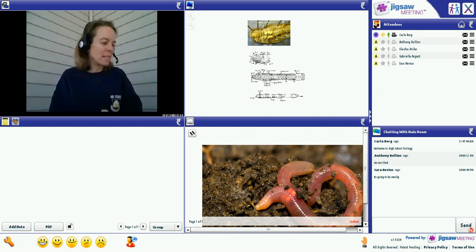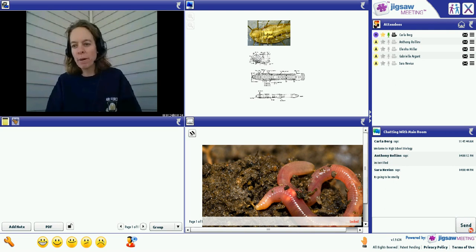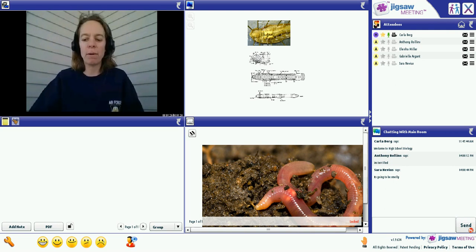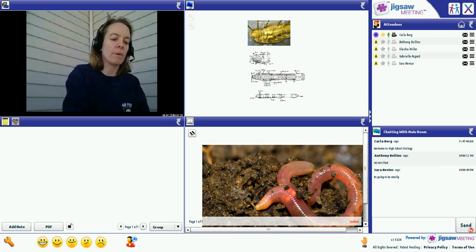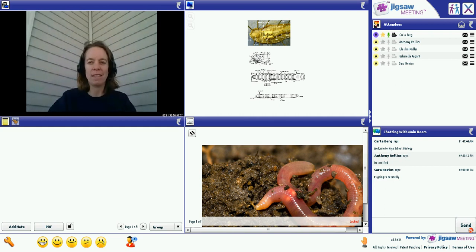So here we are in week 6 of high school biology. Before we start with our lab, which we are going to start right away because it may take most of the class, we have a pig. None of you did the pig. Robert did the pig to share. So if Robert jumps in in a second, he's going to share his project first, and then we are going to go ahead and do the dissection.